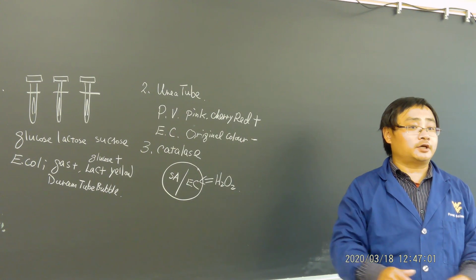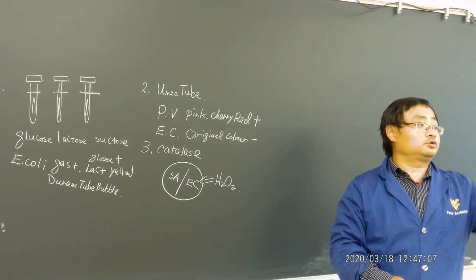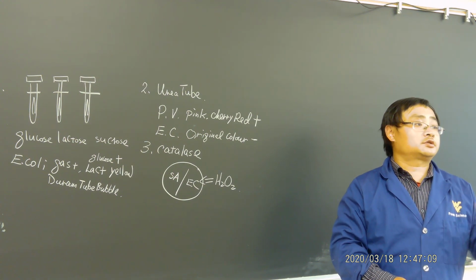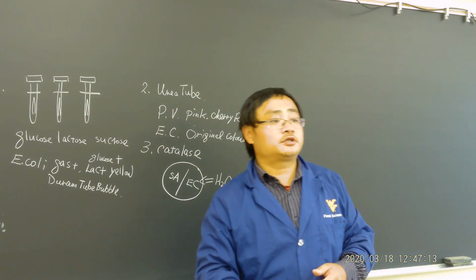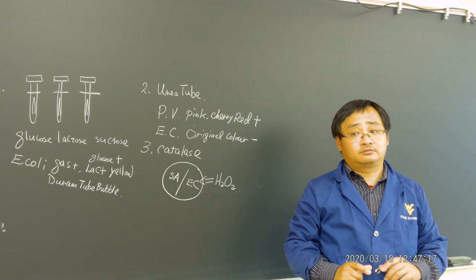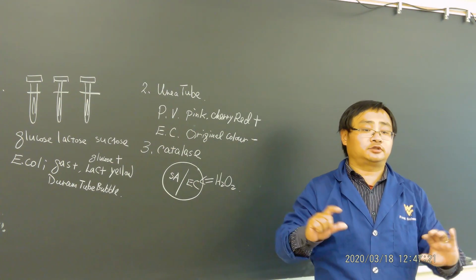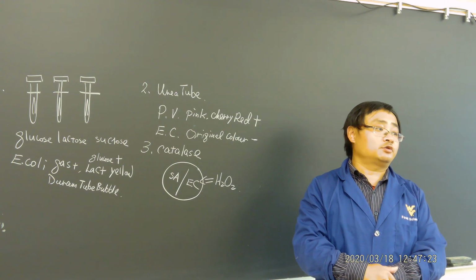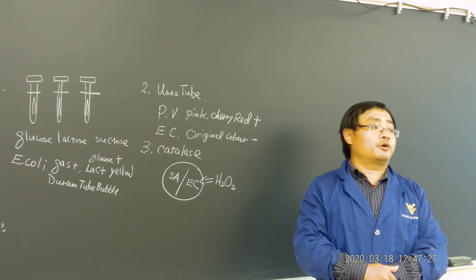Do it. Don't look at me. Just do it. Yeah, just add H2O2. Just give it to all there. Yeah. Very easy. Just add. You will see one side is bubbling. Very obvious. Just add it there. On two sides, add some. Just dump some. You see one side is bubbling. Very obvious. It's like boiling.